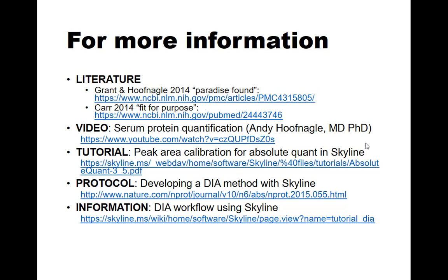Yeah, so MSstats doesn't use that metric for calculating LOD and LOQ. I didn't quite get to it, but they have a pretty sophisticated statistical model to do that if you'd like to talk about it offline.